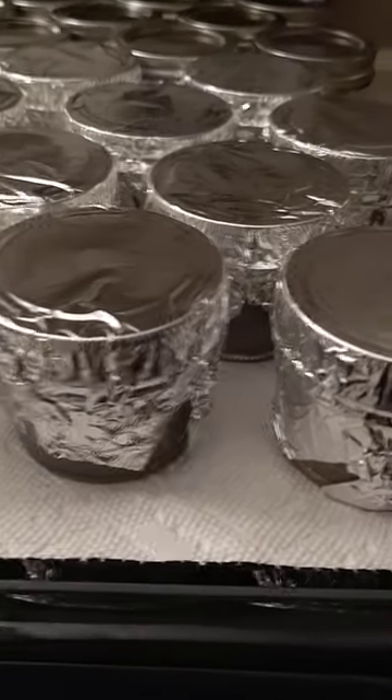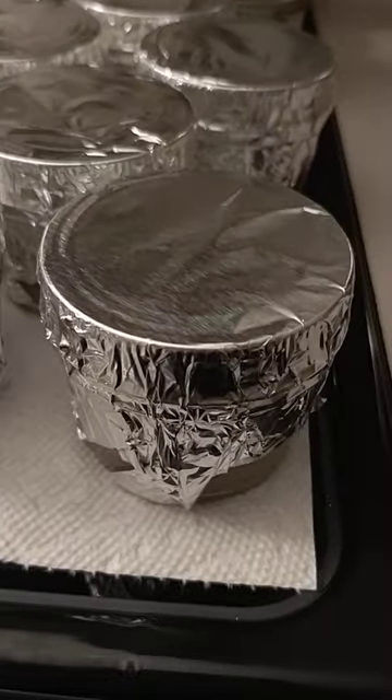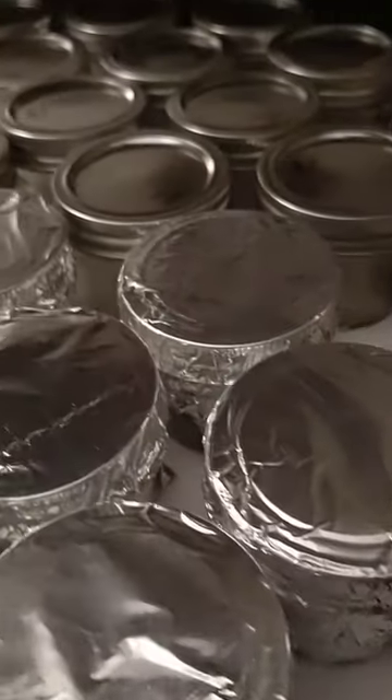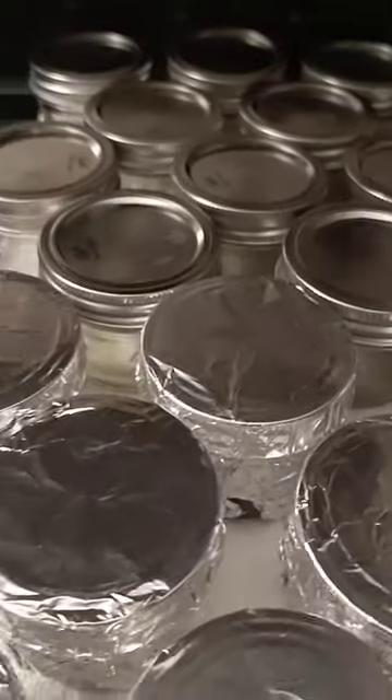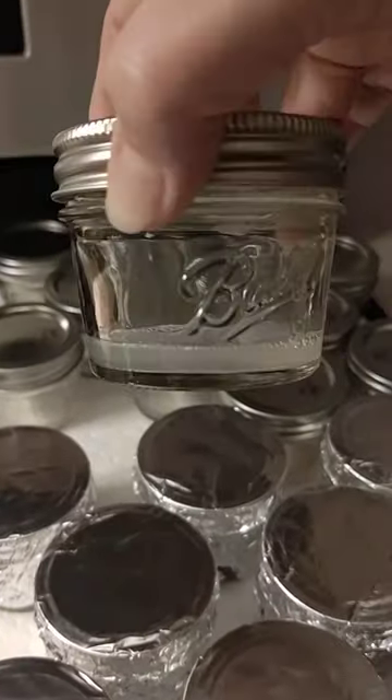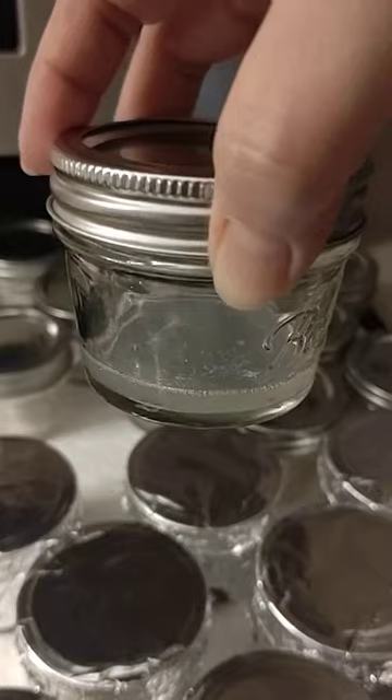Okay, part two — no pour jars. We put foil over the flipped lids and no foil on the non-flipped lids. We did a very light MEA for cloning.